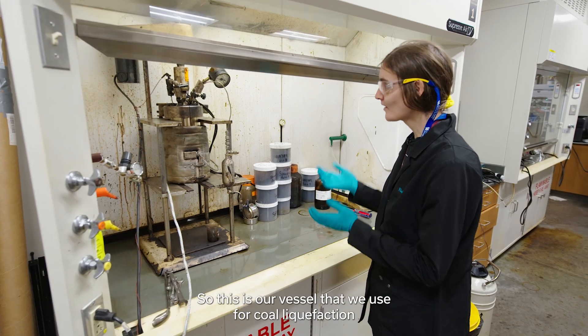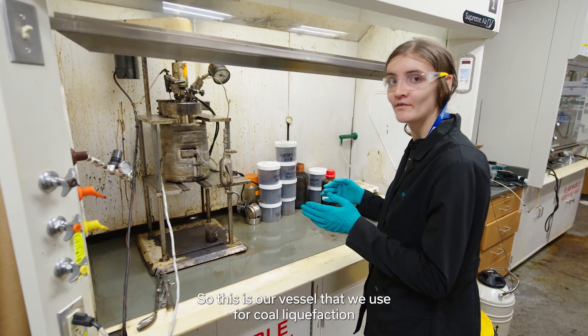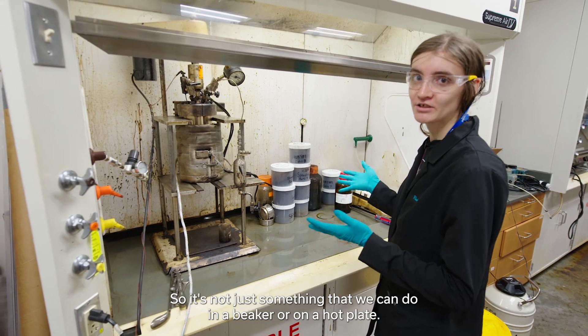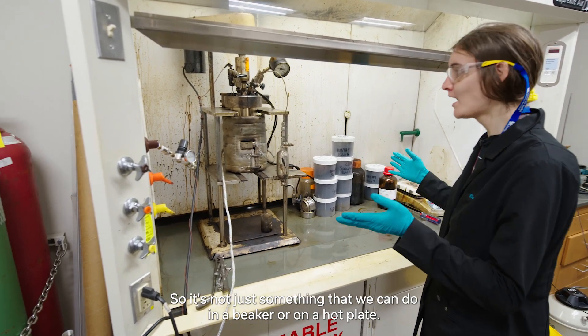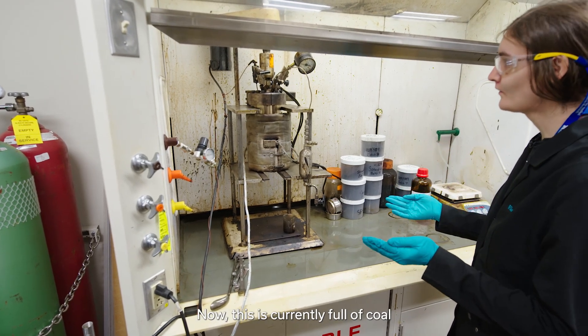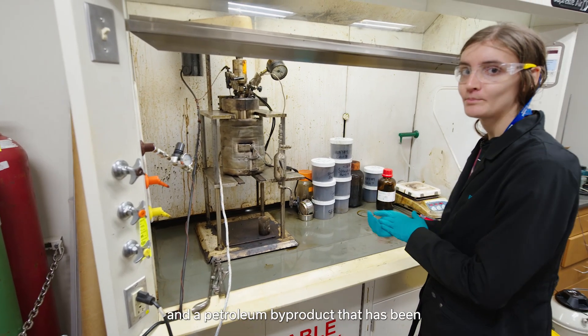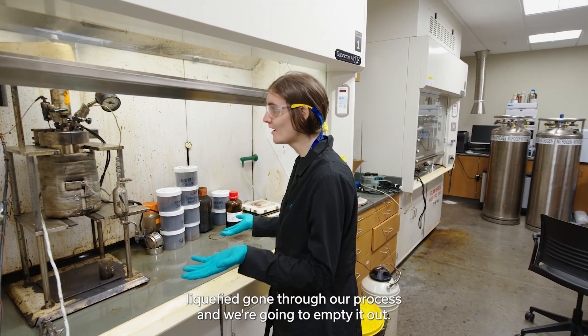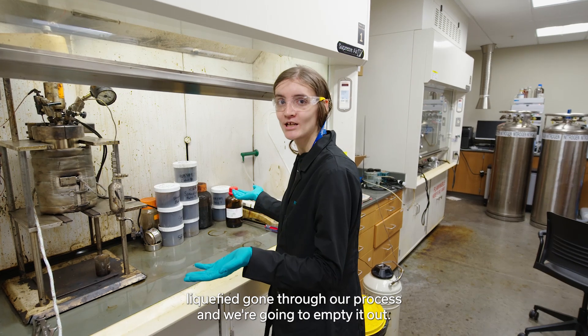This is our vessel that we use for coal liquefaction, because we need to get up to high temperatures and pressures — it's not just something that we can do in a beaker on a hot plate. This is currently full of coal and a petroleum byproduct that has been liquefied and gone through our process, and we're going to empty it out.